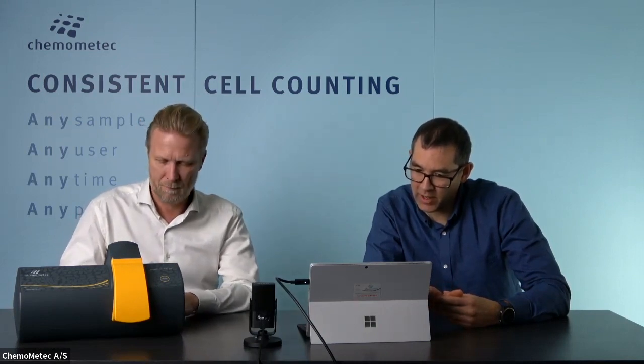A question here that relates to the end of the webinar about MES. The question is, how can we transfer the output of the NC200 into MES in a compliant manner in real time? That's a good question. As you also mentioned during your presentation, all our data are saved as metadata. And when you make a CSV file or a PDF report, the data are exported. Once they leave the workstation, it's really up to the user how to handle them.